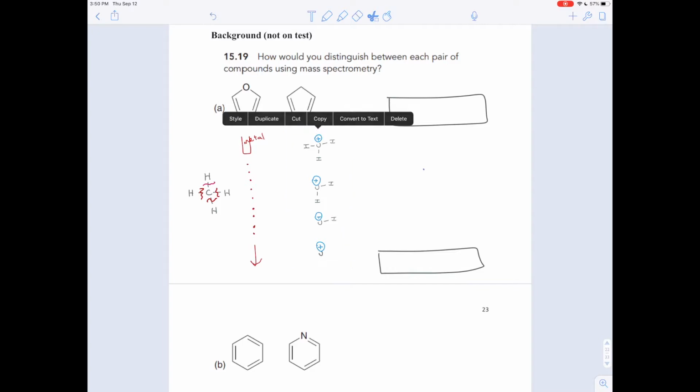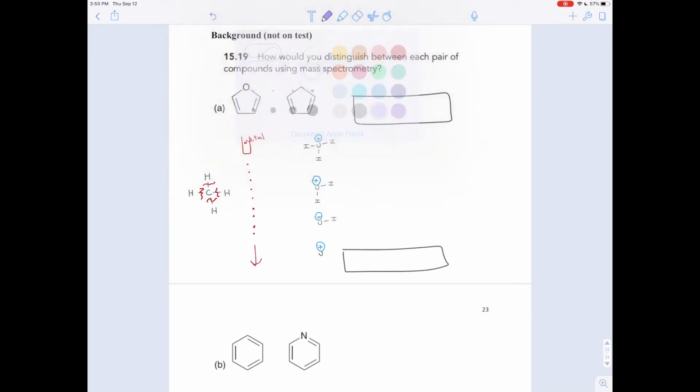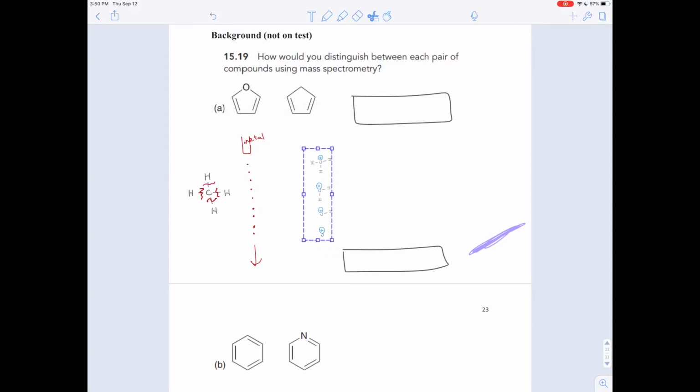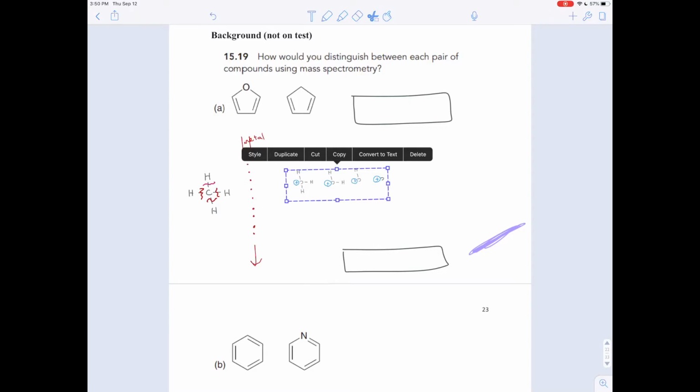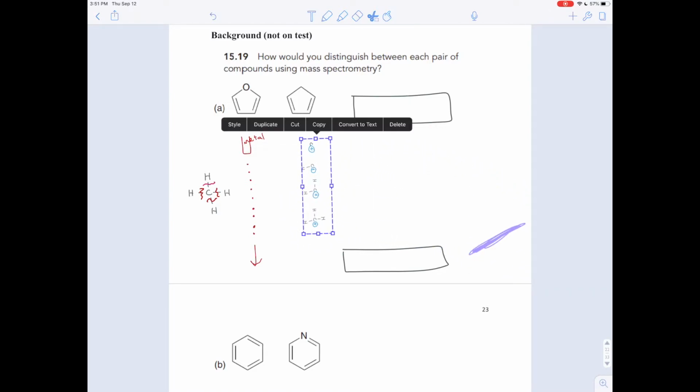And so what you can do is you can position these magnets in such a way that you have a detector over here. And when these charged particles go through, they turn because of the magnet and they hit the detector. Now, I should have it this way, sorry. So they turn and they hit the detector because of the pull of the magnets.